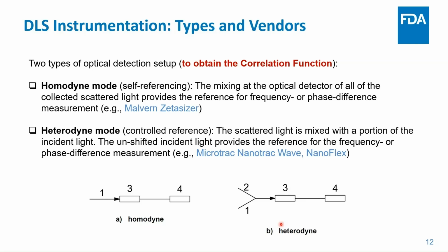So if you're using a much lower wavelength of light, like Xiaoming said, blue light scatters more intensely for small particles. A green light might have a slightly smaller interrogation window than a red laser will, and it won't matter that much, but the laser power might.